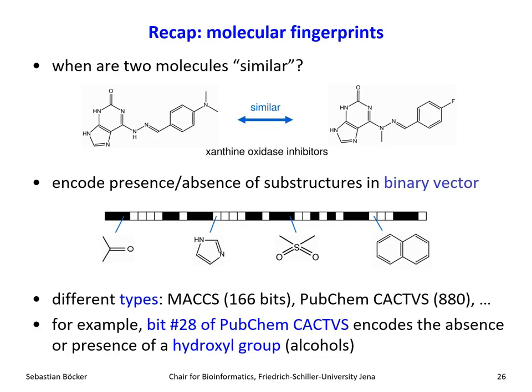So back to molecular fingerprints. I introduced molecular fingerprints in my talk about CSI:FingerID, but back then I already told you that originally those fingerprints have nothing to do with mass spectrometry. So let's forget about mass spectrometry for the moment. Let's just consider what they were originally made for. What they were made for originally, the Morgan fingerprints in 1965, was to check if a structure is already in a structure database. Because checking if two molecules are identical is already a nasty problem from a computer science perspective.